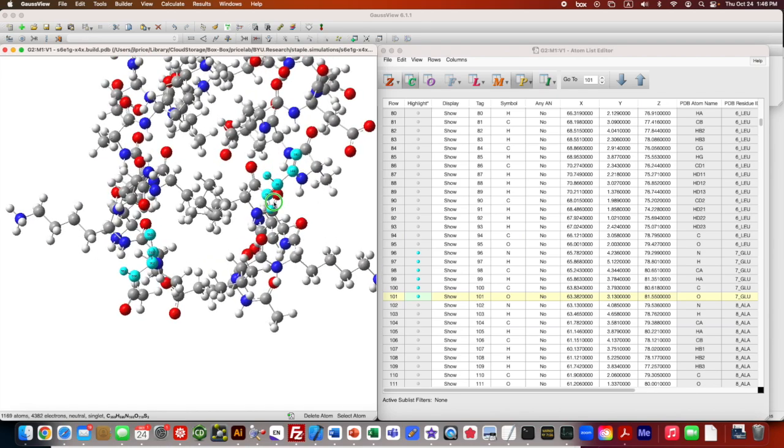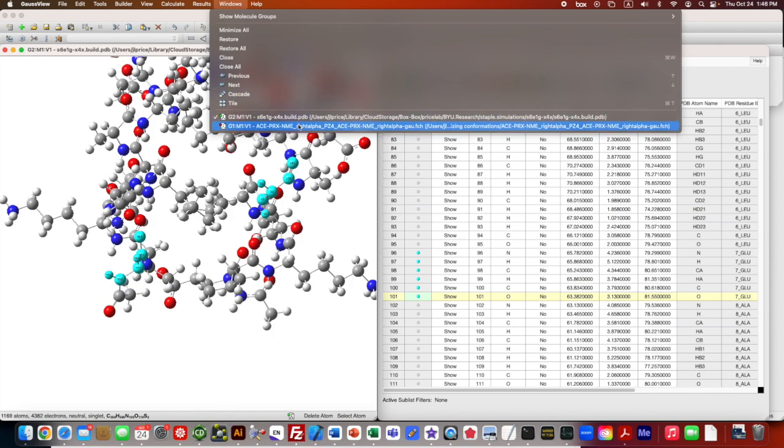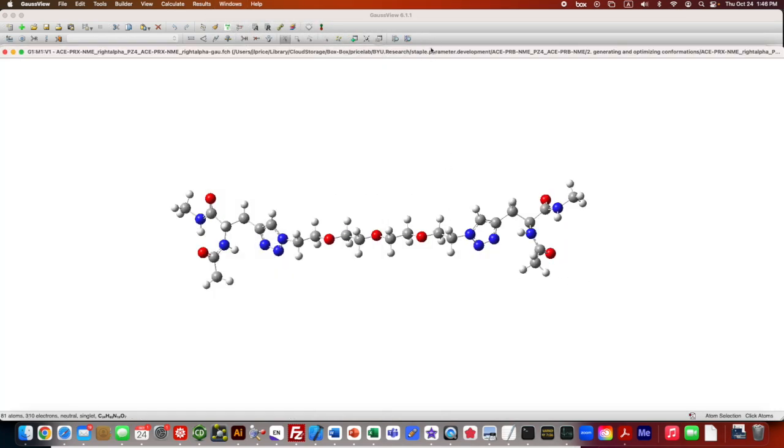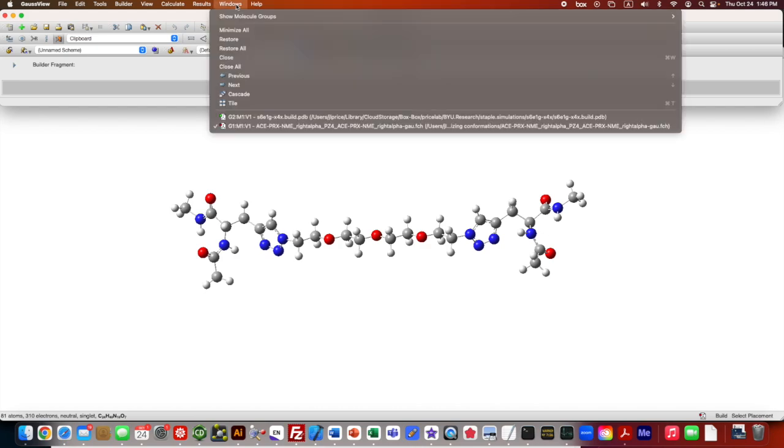That's good for us. All right, so now is the fun part. We're going to paste in the staple. To do that, I'm going to come up to the menu bar, and there should be a tool that has an arrow with a little dotted line square. That's a select by highlighting tool, where you click and drag. That selects all the atoms. You can either do Control C, or you can press this copy button up in the menu line. That copies this structure, so you don't have to build it from scratch.